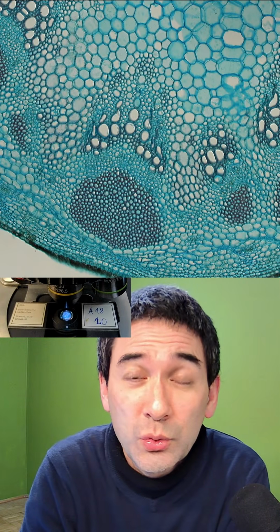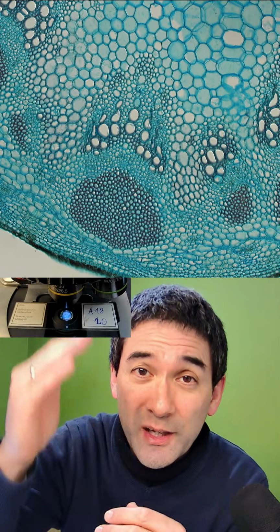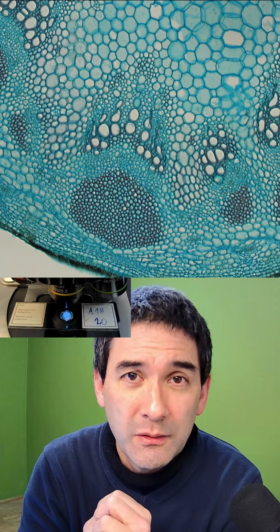And what we have over here, in a sunflower, a so-called dicot plant, are those vascular tissues, the cells that carry the water up and down. You have them on the outside, right? By the way, this is also one of the reasons why you have to be careful not to damage the bark of a tree, because the bark is where the living material is. This is where all of the vascular tissue is for transporting the substances up and down. For this reason, you've got to protect the outside.